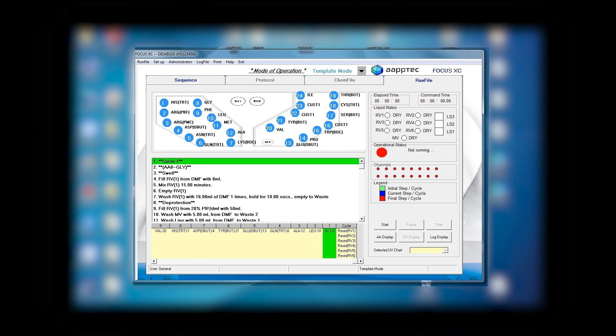You see also that above the first line is green. This means it is the initial step where you start the reaction. Remember when you are doing this chemistry and synthesizing the peptide and you have stopped, you can restart the synthesis any position you want. But when you are in the beginning, it automatically goes to the first amino acid.